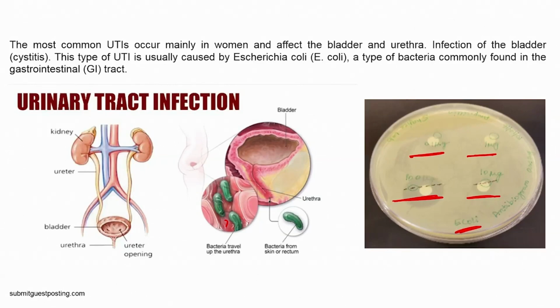So, what I was talking about is, when the sample is collected, the bacteria from the sample is extracted, or captured, and is grown using the growth media, right.